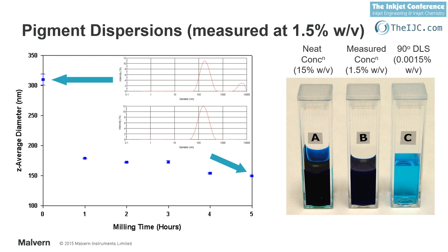Yeah, so it would have an effect of that. It's basically the diameter of the pigment particle plus the surfactant, because that will affect how it moves in the dispersion. So if you're attaching things to the surface, they'll play a part. I was more considering, say you use an acrylic polymer with 100,000 molecular weight, for example, what sort of effect that would have in terms of the hydrodynamic radius when it's being used to disperse a pigment?